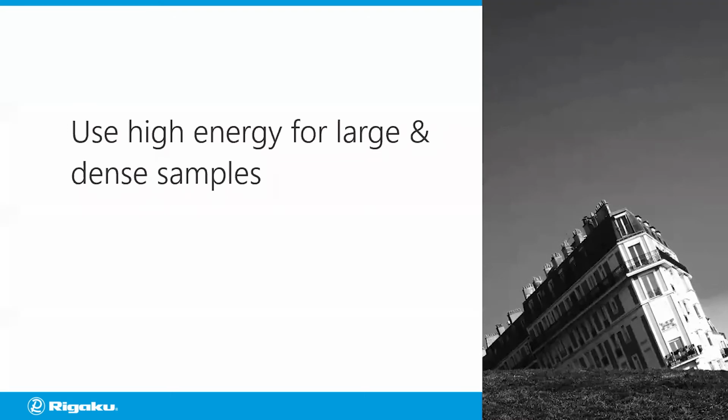The other point is, you might be wondering why I'm showing this tilted building in the picture. Well, this is the reason. You want to tilt the sample. I will explain what I mean by this. When you have a box-shaped sample like this one, you might be tempted to just put it straight down on the table, shoot X-rays, and image it.